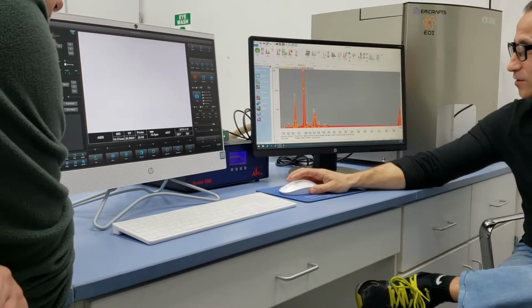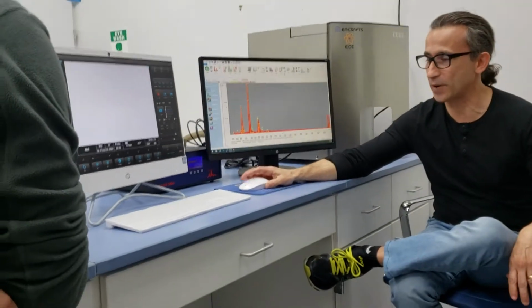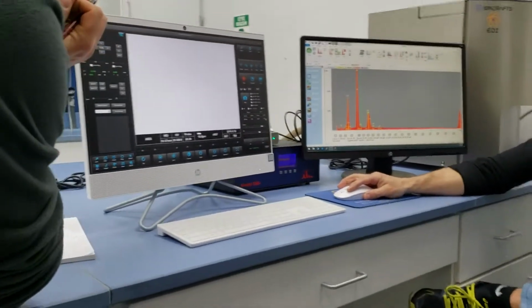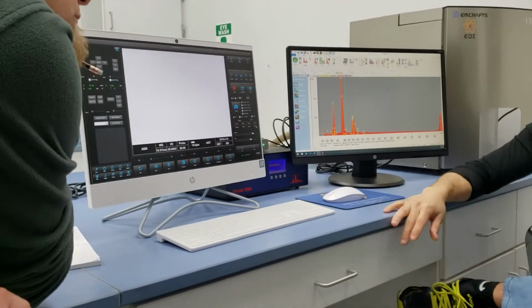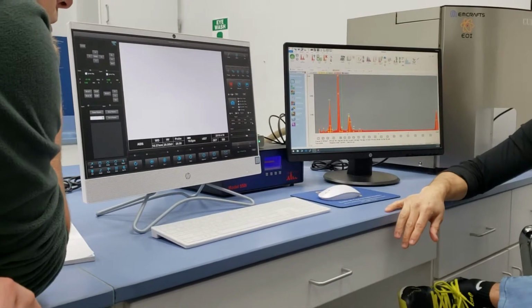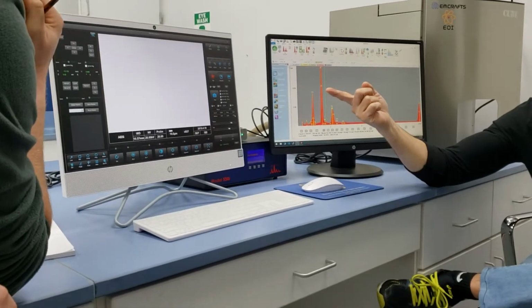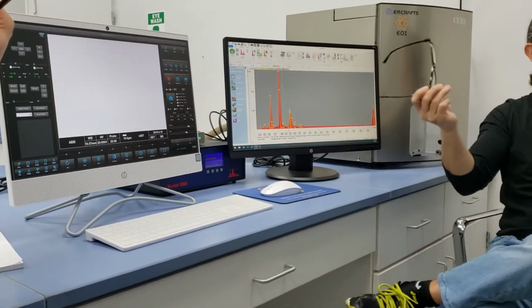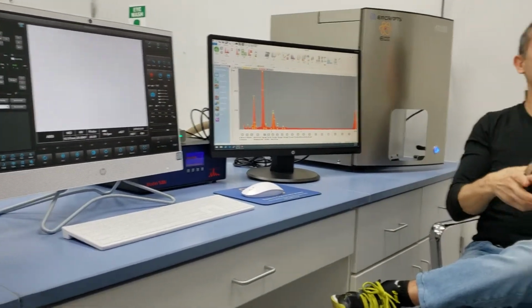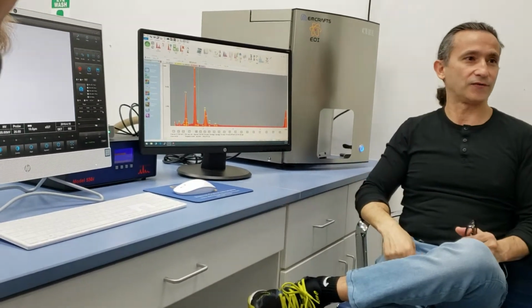Right? X-ray events. This is how many X-rays are hitting the detector. And that gets determined by how big the diameter of your beam is, because what's generating the X-ray counts? What's generating your X-ray counts? Where are they coming from? Beam. Okay, so beam is important. The X-ray counts are coming from your beam. With no beam, we just did that a second ago. When I turned the beam off, did we have any X-ray events? How can we have X-ray events with no beam? There's no beam on, right? There's nothing to generate X-rays. So the beam and the beam diameter and the final aperture assembly determine how many X-ray events we're going to have.